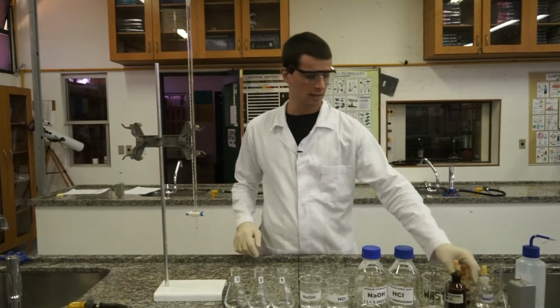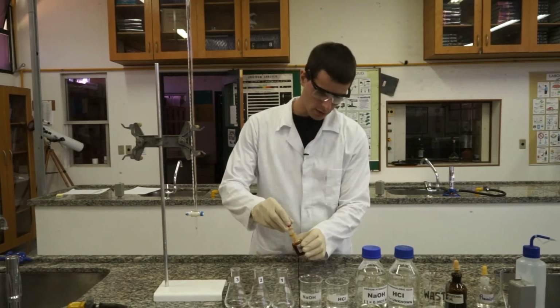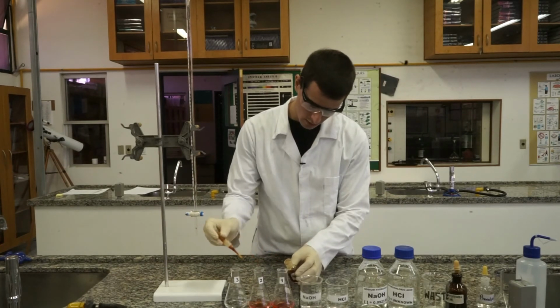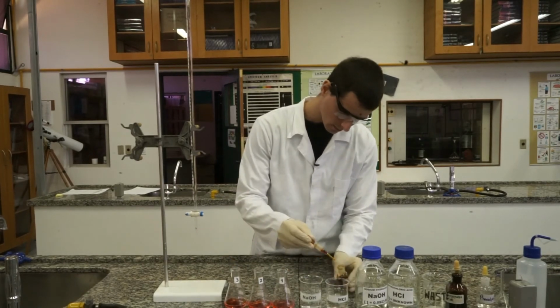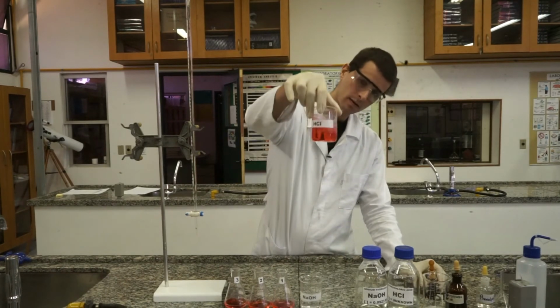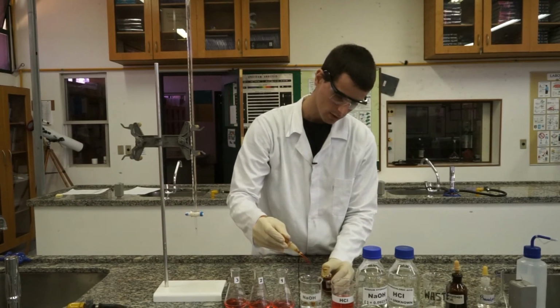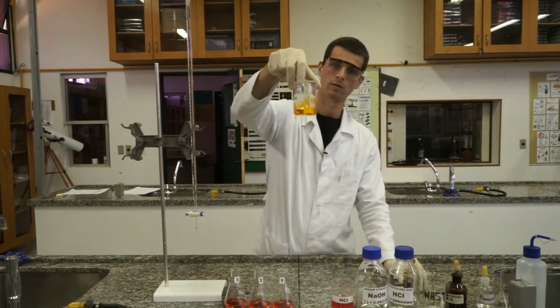Finally, let's do the last titration. We're going to use Methyl Orange as an indicator. In acid solution, Methyl Orange is red. Look. And in basic and neutral solution, it's yellow.